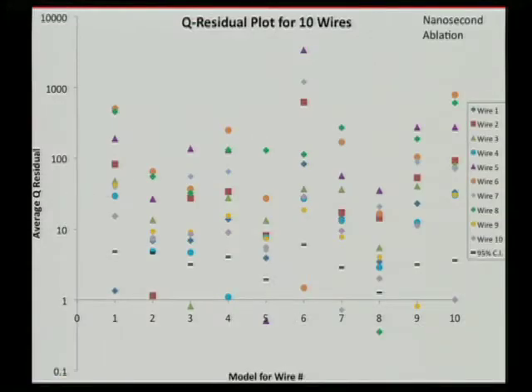So this is the data that we got, and I know it's kind of cluttered, but also, before I say anything about distinguishing these, within the 8 feet of copper wire that we sampled, within the small strands, they were all homogeneous.